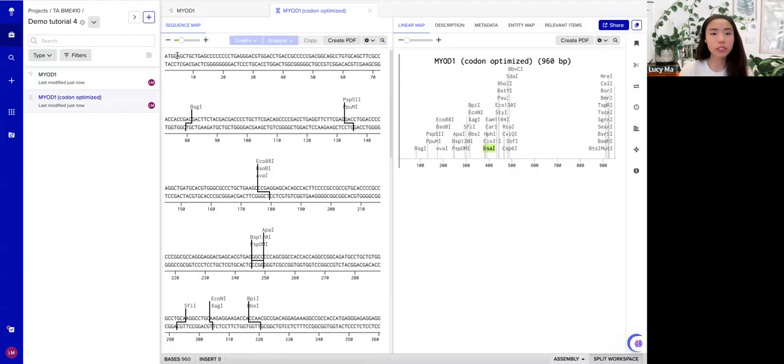But if you wanted to just use it as a gene fragment, then the start codon is what you need. Okay, so now that we have this sequence, this is the cDNA of this gene, which is different from the genomic DNA. So in a separate talk, we'll talk about the differences between the genomic DNA and the cDNA. Here, this is the sequence that is needed to express your gene of interest. So now that we have the sequence, we can order this either as fragments and put them together in the lab, or we can use it for downstream in silico analysis.